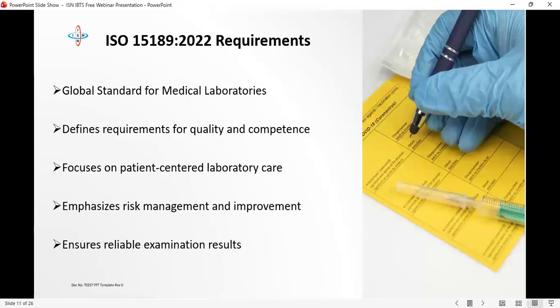The scientist at every point in time is aiming to deliver accurate results. He's properly trained on the procedure. Even if it is a manual pipetting procedure, the scientist has documentation of having been trained on how to pipette accurately, avoiding error due to parallax.